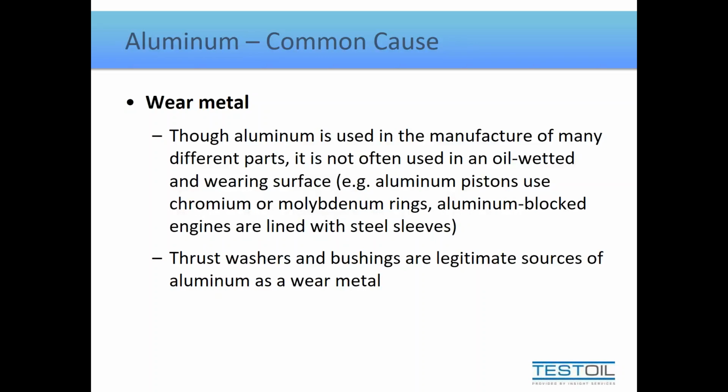So if aluminum isn't a wear metal, why then do we see it so frequently in oil samples? Well, if you've ever heard the expression, red sky at night, sailor's delight, red sky at morning, sailor take warning, you've actually been told very indirectly why that might be. When we have a sunset that is not our normal yellow, orange type color, when it starts to go into the glorious reds and purples, what's changing is the atmospheric contamination, and that's what's changing the wavelengths of light that bounce off the atmosphere.